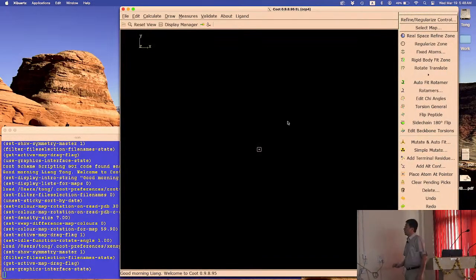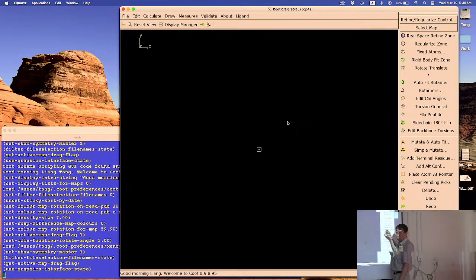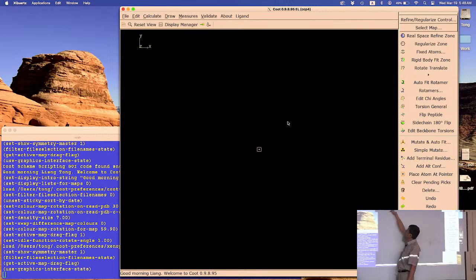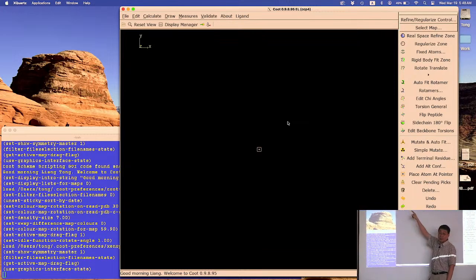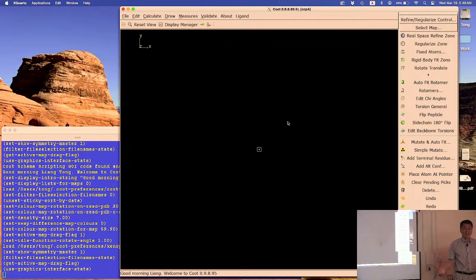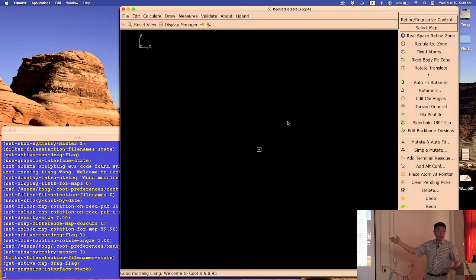All right. So everyone should have a menu bar on the right with text. Okay, not just an icon with text. And then the menu bar on top should also have text. So everybody good? Yes. Thank you. Speak up, please. Because otherwise I don't know where you are. Please help me, okay? So, good?